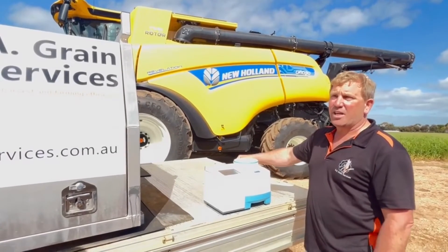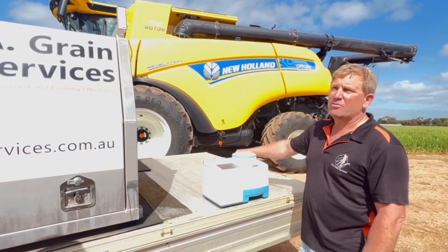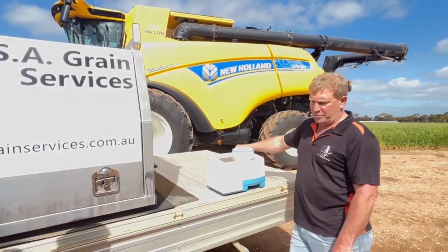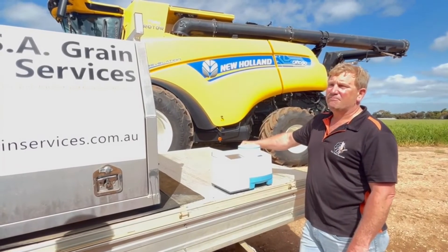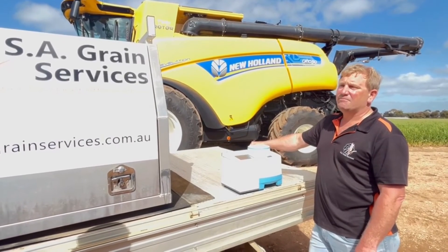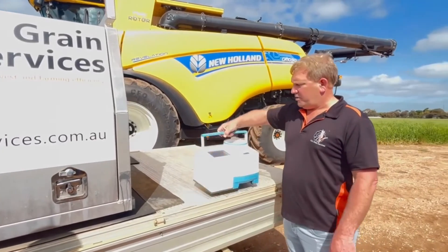We can recalibrate it if we have to, but we haven't needed to recalibrate too many of them. I've been using this model myself as a farmer for about five years and never had a problem — always been 100% accurate and reliable. They're very light indeed.